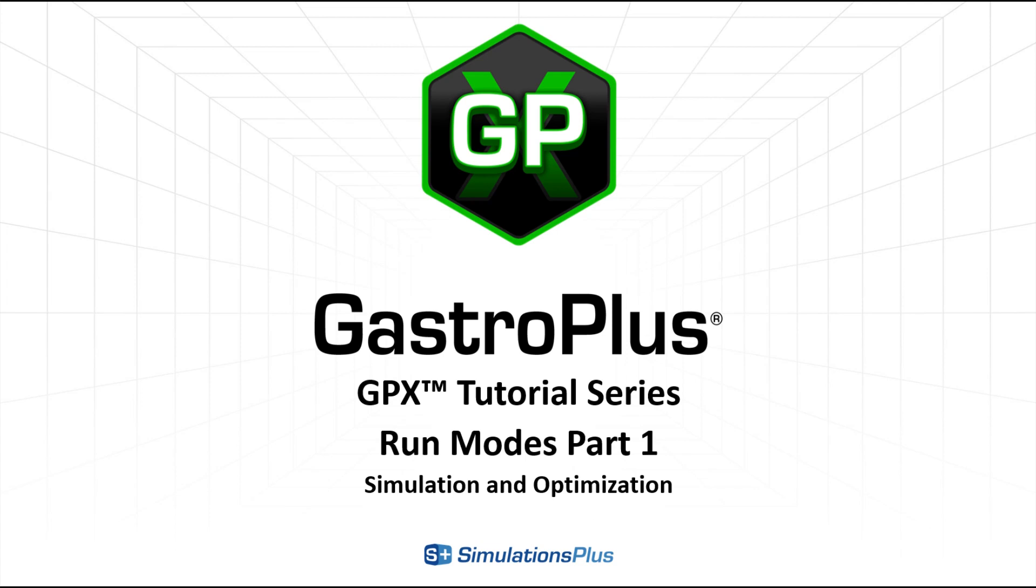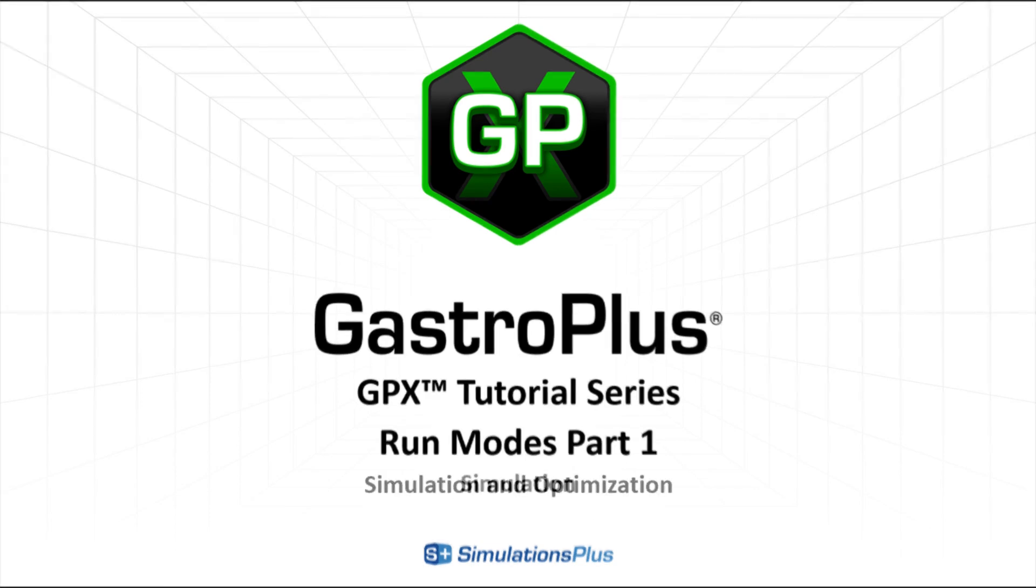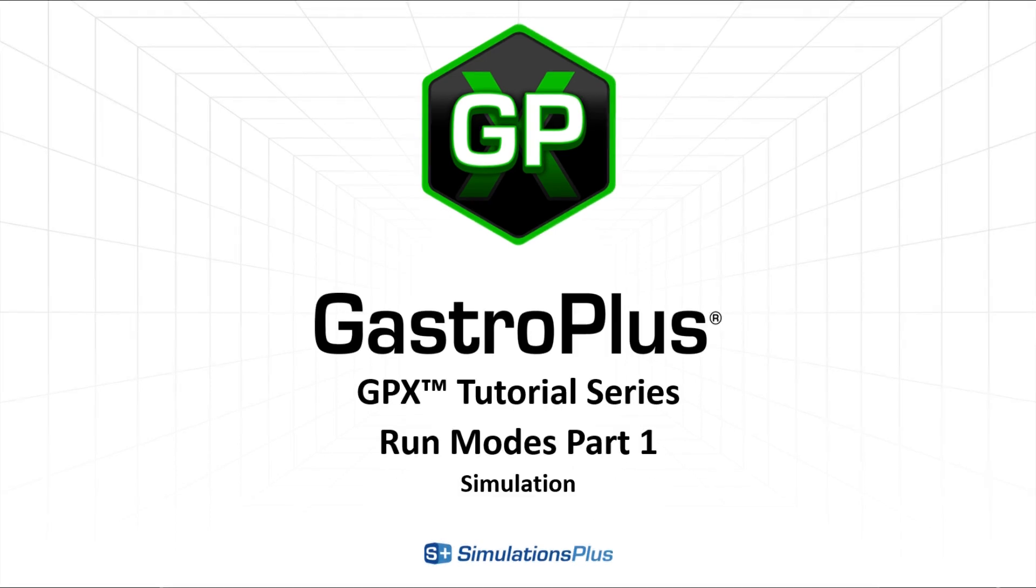Hello. In this video, we will cover the run modes in GPX using the GPX library project.